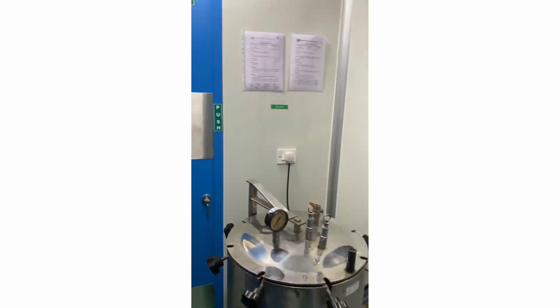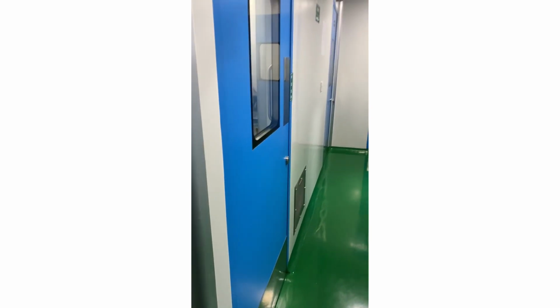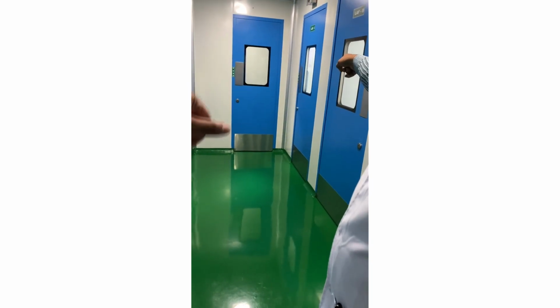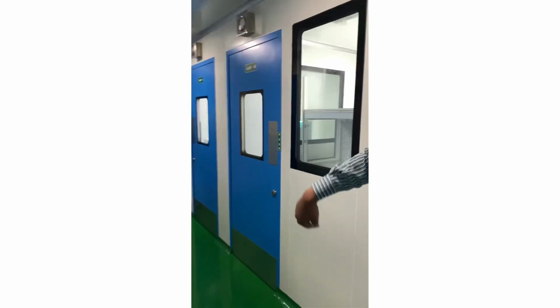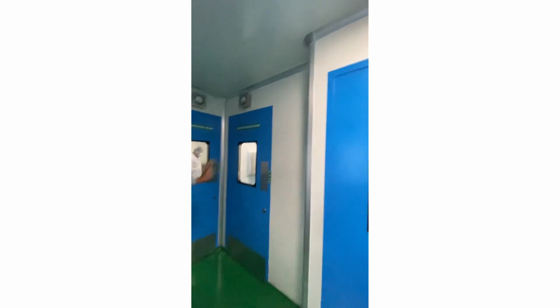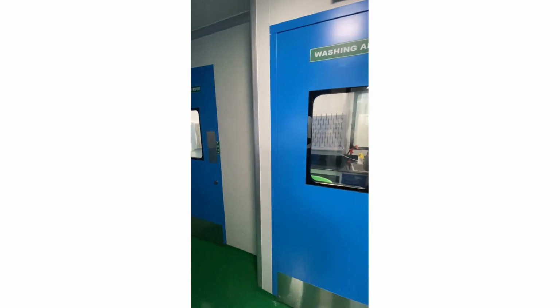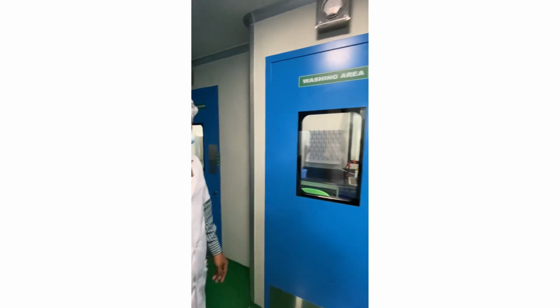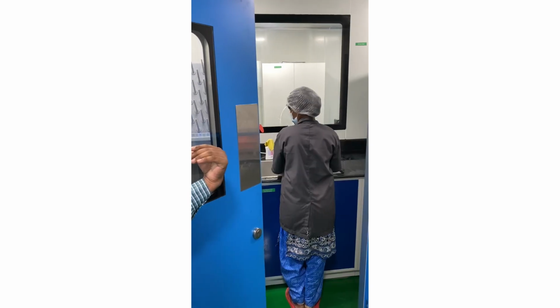Our laboratory is unidirectional. Once we get the sample from reception, we take it inside to the sample preparation room, then the analysis room, the incubation room, the confirmation room, and the decontamination room where the organisms are killed. Then it goes outside through that emergency exit. It won't come inside again. It's unidirectional. Once a sample comes, it goes like that.